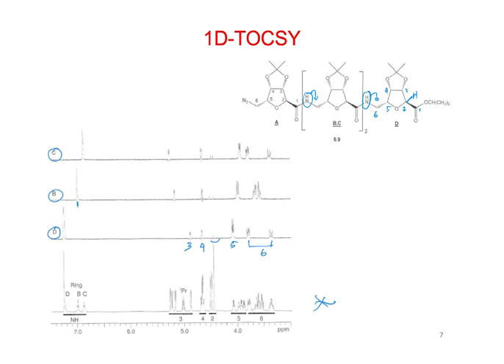And we could see all 3 of these except for this one over here because it has no NH proton. So you could probably just line those up and basically assign all of these. Well, you'd have to know which NH is which, I guess, to know which ring was which.